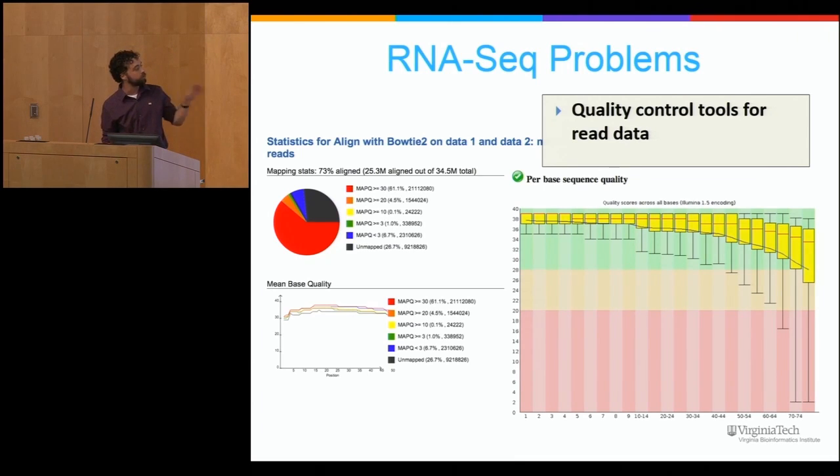And so what we try to encourage them to do is to look at the characteristic tailing in the base calls that come off modern short read aligners, and to look at how much of their sample is actually aligning to the genome. That's the whisker and bar plot on the right. In this case, red is good and black is bad.